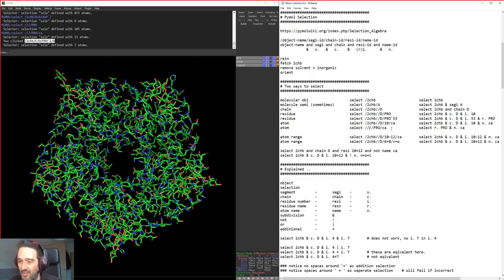So there's actually a second bunch of selection criteria which doesn't use the slashes and instead uses a more intuitive written form, and it looks a bit like this, but then you can also abbreviate it to look a bit more like this. So what we can do here is just ignore the slashes, and we can say, well, select the object 2CHB. That's nice and easy.